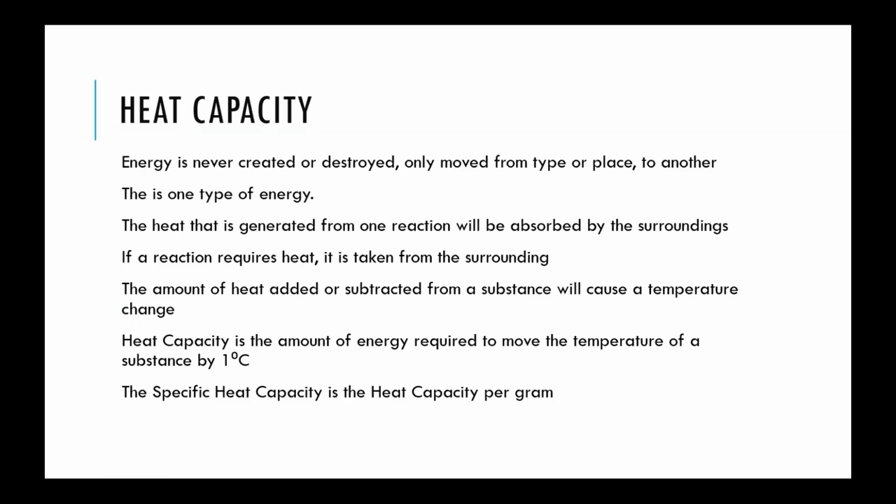The amount that the temperature increases is related to the heat capacity. Each individual substance has a heat capacity, and the heat generated from a reaction is transferred from one place to another.